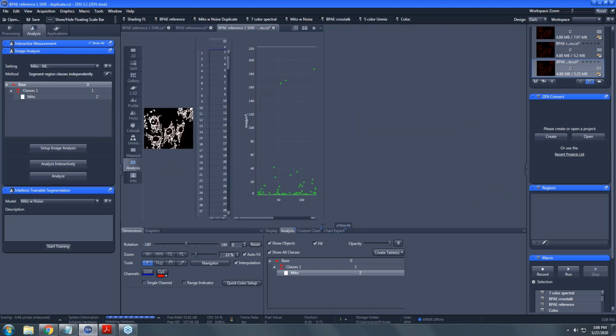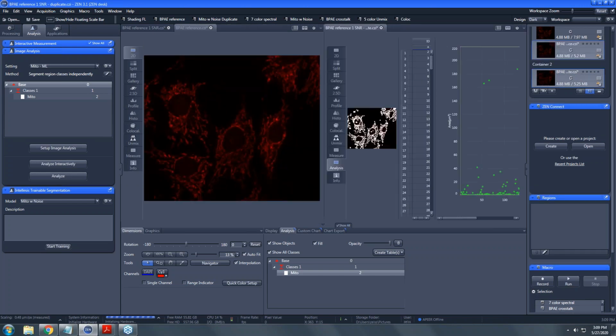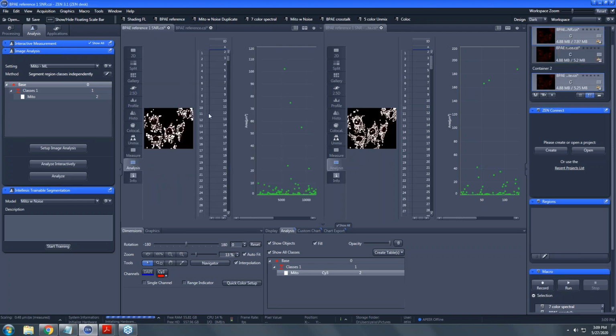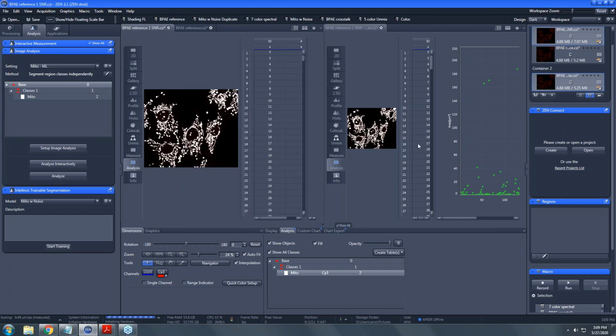All right, so Nicole just made us 2 containers so that we can drag this. So the machine learning, remember, is on the right, and the classic image analysis is on the left. There we go, now it is. It lags, sorry. All right. And we want to resize these windows so that we're not seeing the table or the graph here because we're losing some desktop area. And then we can zoom in on each.